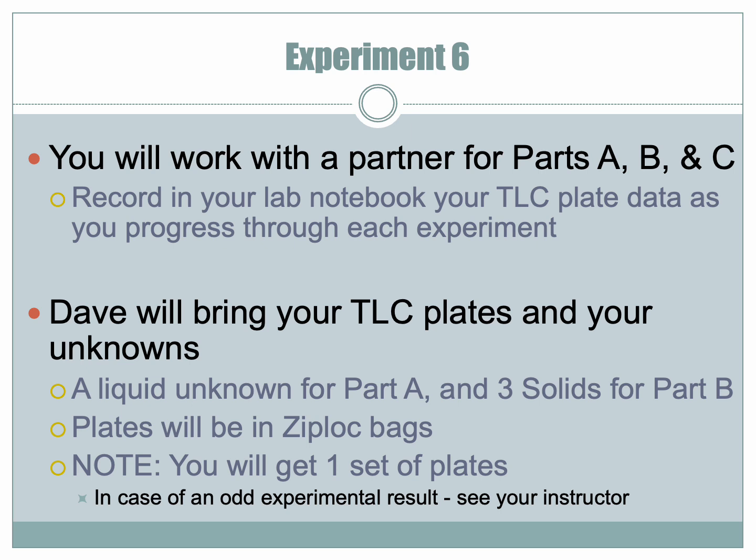Plates will be in Ziploc bags, and you get 1 set of plates. So as I had mentioned before, they're kind of expensive, and so before you start marking the real deal, use the practice plates to make sure you're making your spots the correct size.